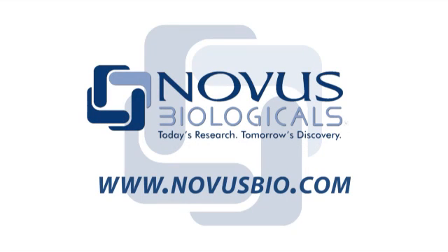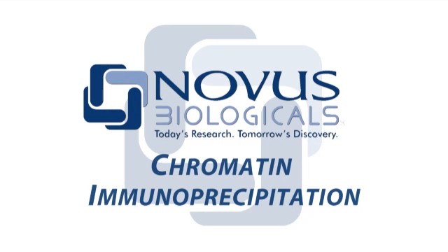Welcome to the Novus Visual Protocol series. In this video, we will learn how to perform all phases of chromatin immunoprecipitation from lysate prep to DNA quantification.